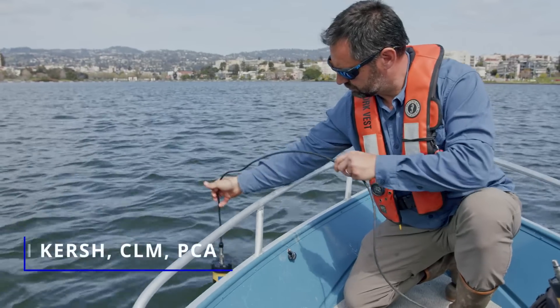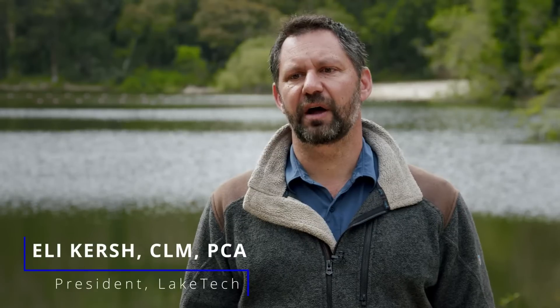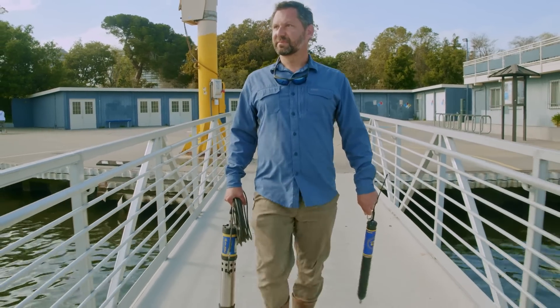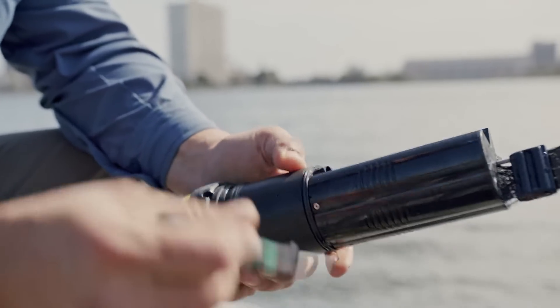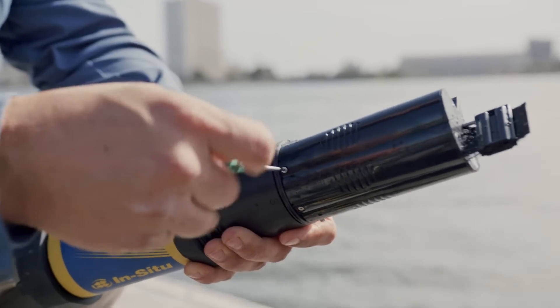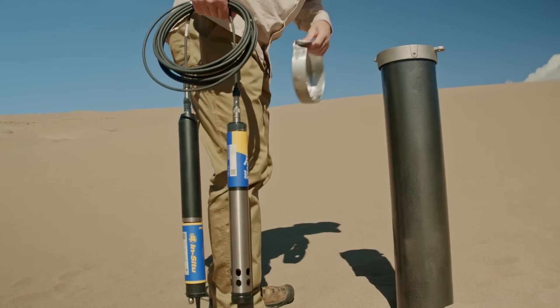I discovered the Aquatrol about 10 years ago and found that it offered a lot of features and functionality that I didn't find in other equipment in the marketplace. The thought that went into the design allows me to really use the equipment in a versatile way where I can swap sensors to customize the piece of equipment for whatever the project is. Talking to customers is the most important thing in my role because we need to understand their problems in order to create products that will solve those problems and be easy to use.